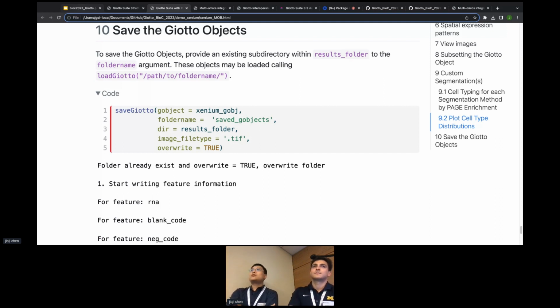So can you say one more? Yes. It provides functionality for dealing with subcellular data essentially. So it can work with points data in really efficient manners. It can also work with polygonal information as well. So those representations were not previously existing inside of SpatialExperiment.